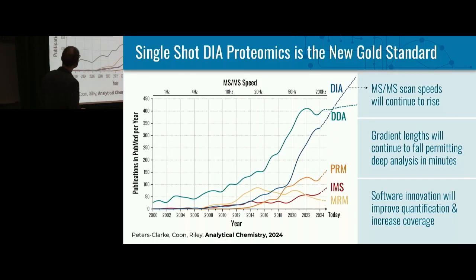I started with this slide. These are my thoughts about how things are going to unfold, but I think that MS scan rates are doubtless going to continue to rise. They're going to get faster.